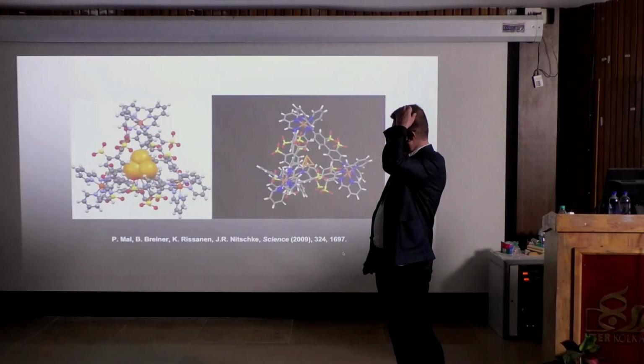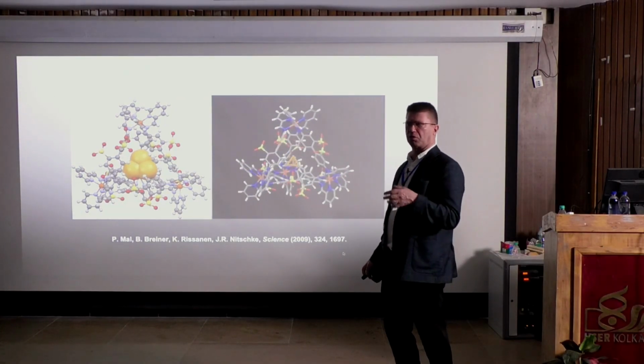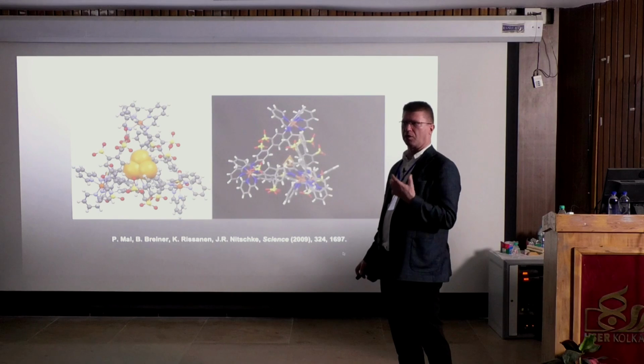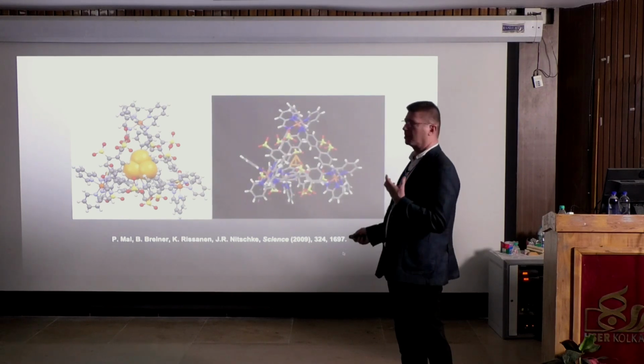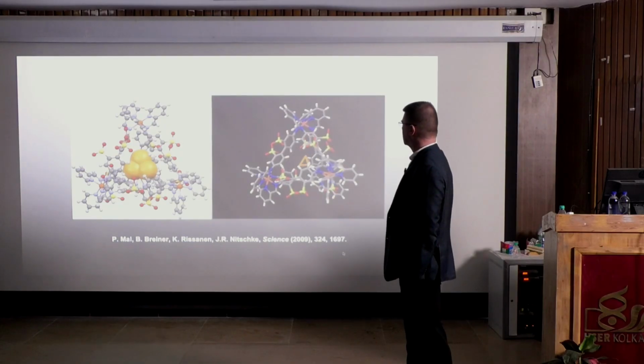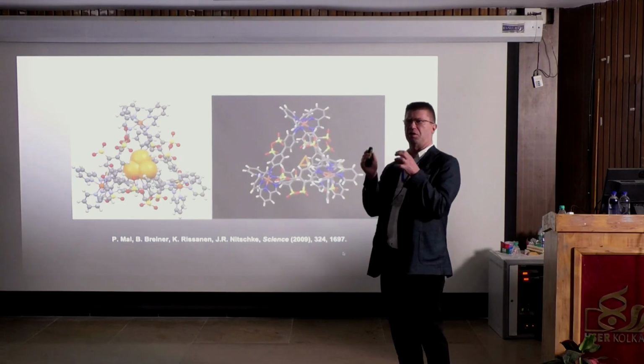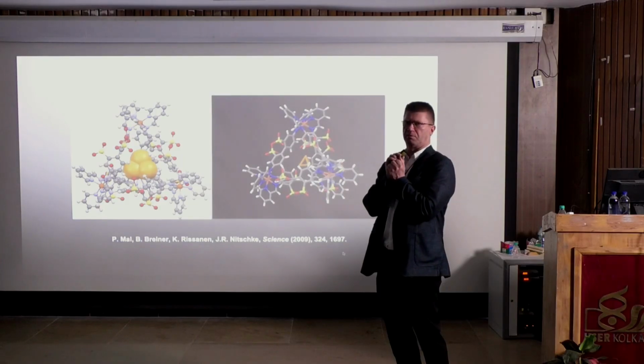And this is actually what we did, and this is now the X-ray structure. The X-ray structure is really crucial, showing that the white phosphorus is inside. So it's here. Now you can see the rotating image. So it was rotating a bit. Here we have the white phosphorus, drawn with the space filling model, and you can see that it's really tightly trapped.